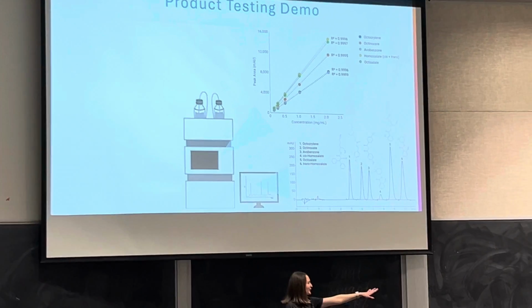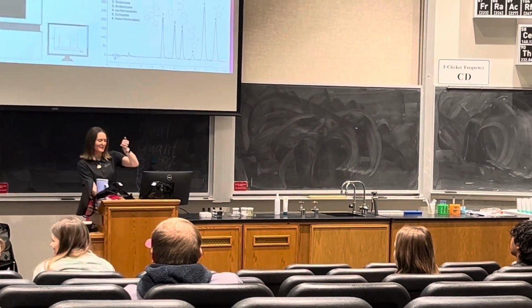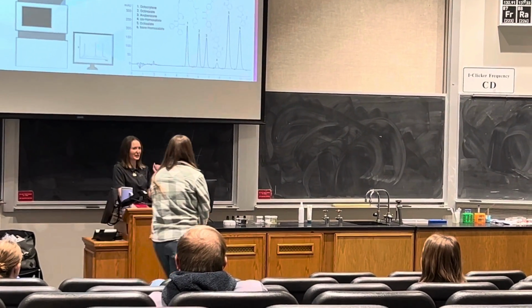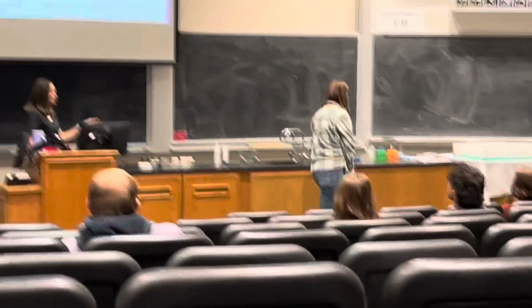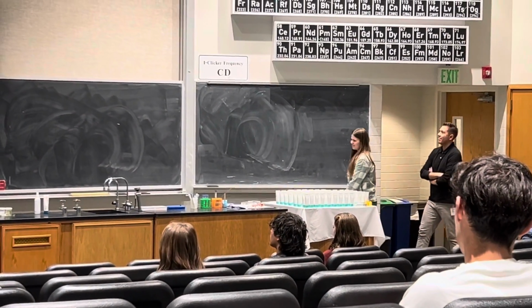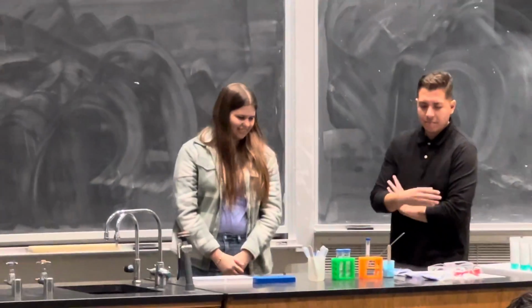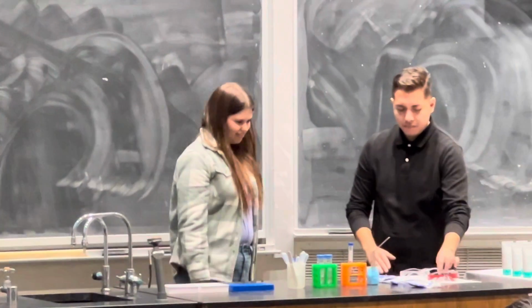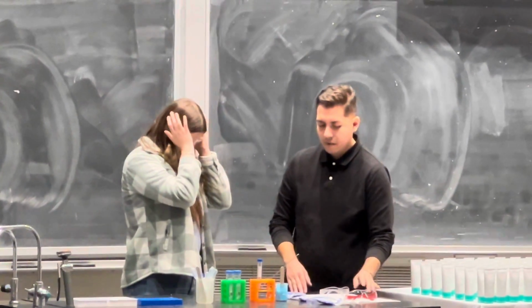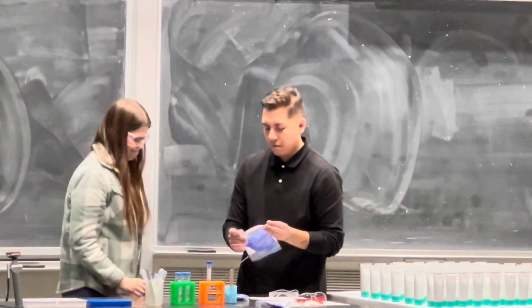Okay, next volunteer. Who wants to be our analytical chemist and extract this sample? Yes, come up. What's your name? I'm Katya. Katya, thank you. Beautiful name. Okay, so James is going to help you do the extraction. First, I would recommend you put on some PPE, because that's what's required in our lab. Minimum of safety glasses. I also recommend gloves. You're only dealing with water and isopropyl alcohol though, so it's up to you.